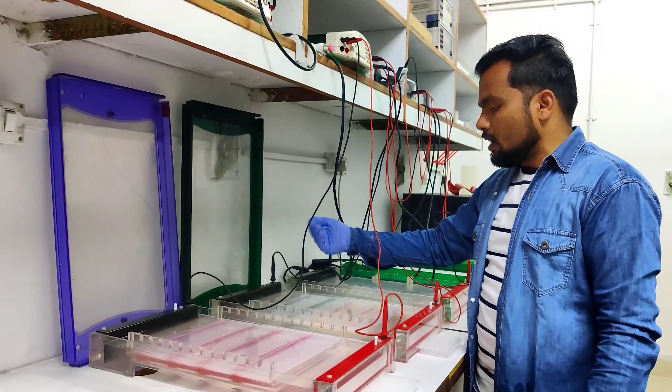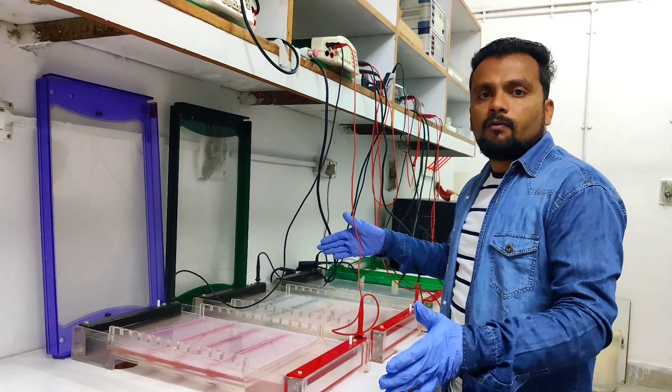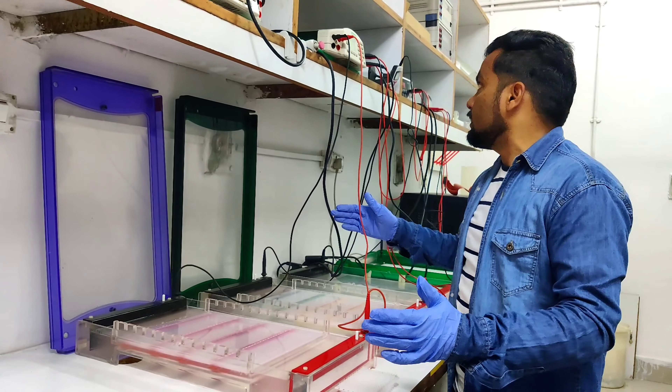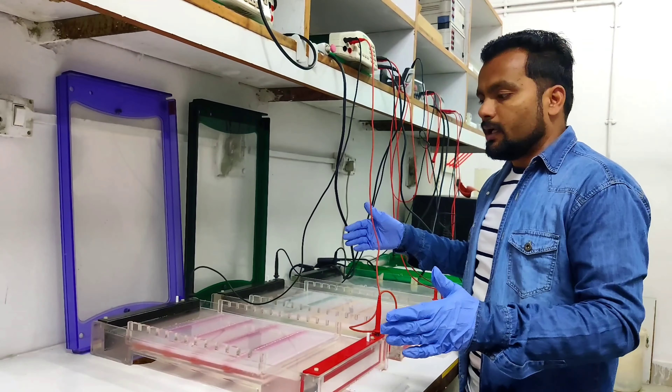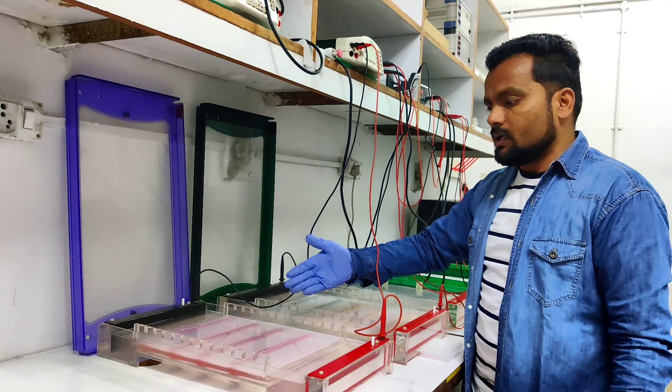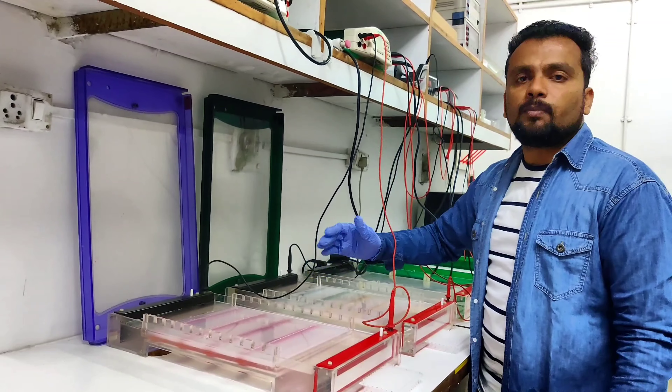You can see the bubbles coming upward from the lower side. It will take about two hours. After two hours I have to check with the UV light — I will show you the UV light — and check how much our PCR product has run. Then I have to upload the second plate.